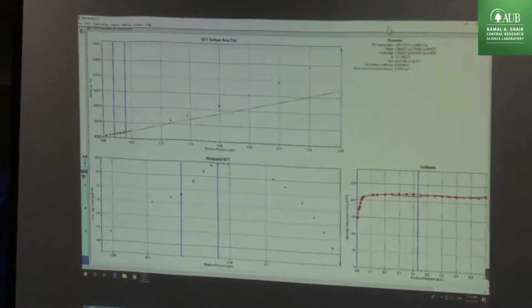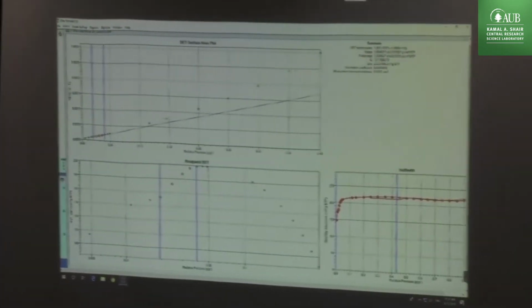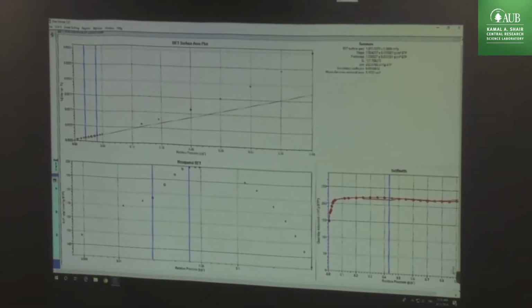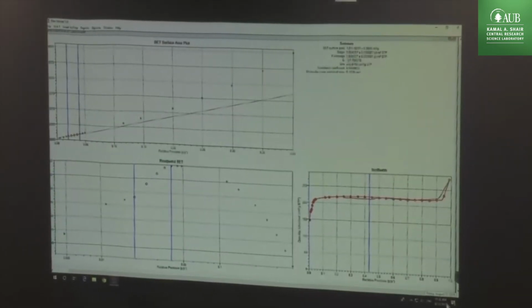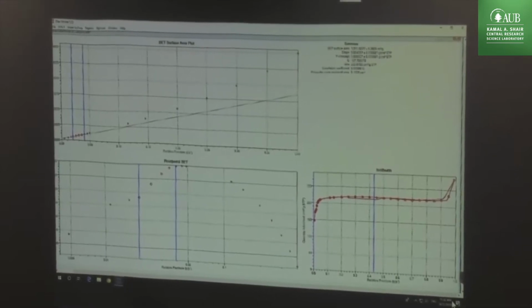Okay, so in this case, we had the same configuration. Let me see if I can see it here. Here at the end, if we have something like large pores or interparticle pores, it can be seen only very close to 1 relative pressure, P/P0 of 1. In this case, as we're closing to 1, that's what I'm talking about, somewhere here. Oh, sorry. I'm not good at this, which is why my son does everything for me. I don't care about these things here.